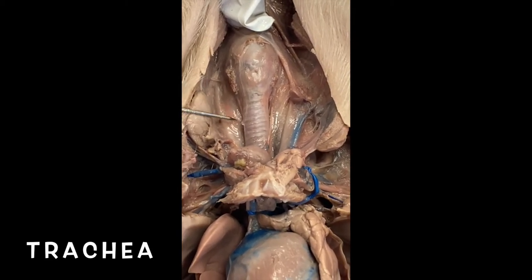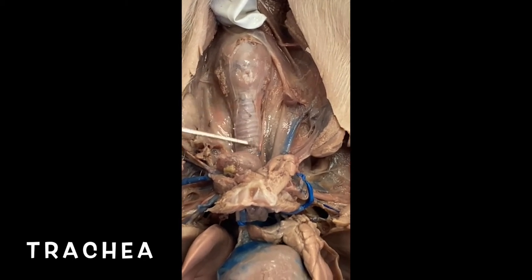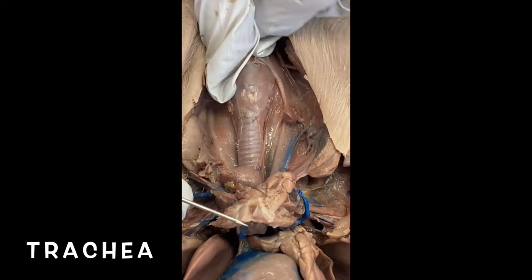And even if I remove more connective tissue, you may be able to see it. But it is, oh, there we go, a little bit. It has ridges in that. And that's the trachea where your air goes down into your lungs.